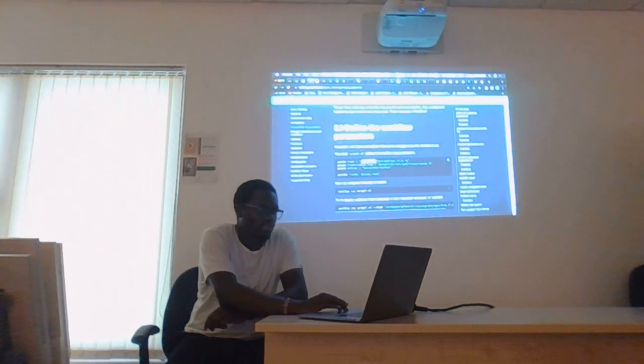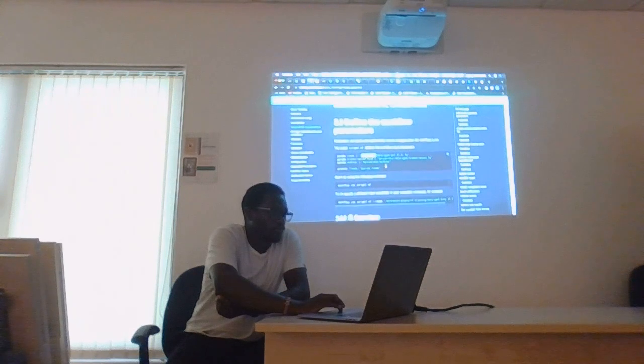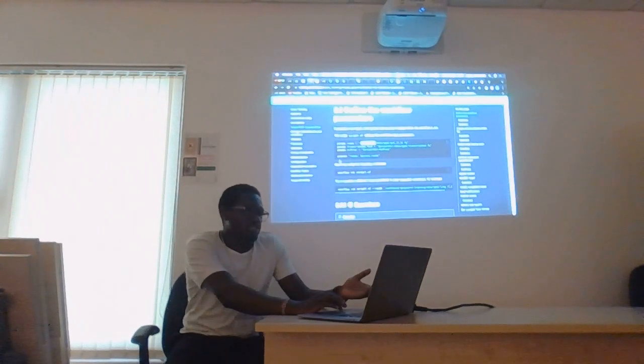And similar to shell or bash scripting, this variable is preceded by a dollar symbol. So for you to print, for instance, in Nextflow, you use a keyword called println, and that will print, for instance, reads, and then it will look at the variable here, params.reads, and print that. So similar to shell scripting, this is a variable, and it has to be preceded by the $ sign.